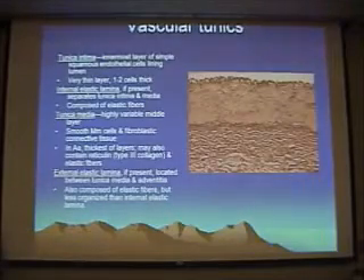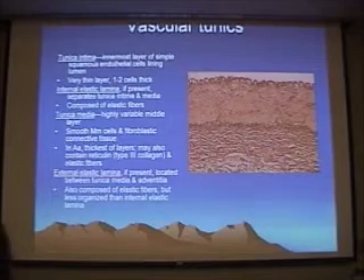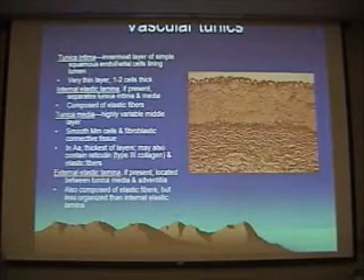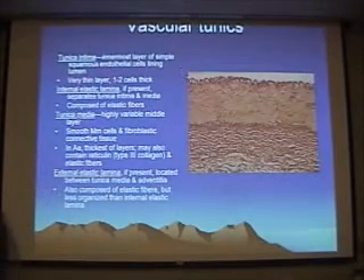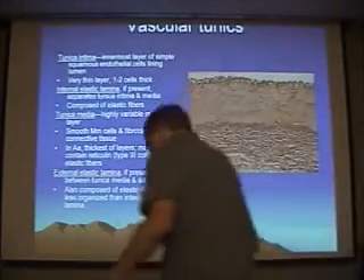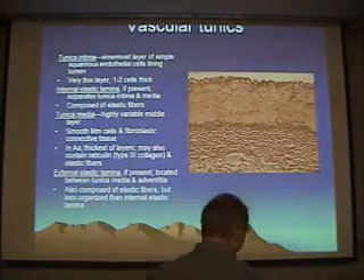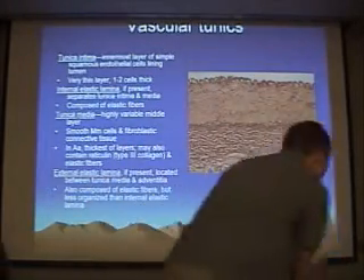We start with the circulatory system. First we had blood vessels and vascular tunics, so you should be able to identify vascular tunics and the different types of blood vessels. The tunica intima is a very thin layer, just one or two cells which lines the lumen. Then we have this very nice internal elastic lamina — this is a special stain, so it highlights those elastic fibers very nicely.